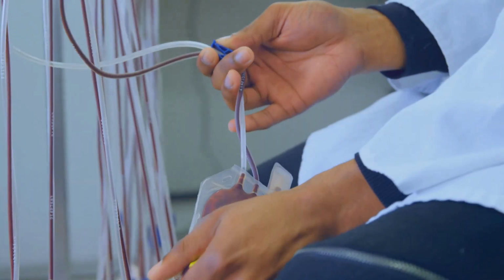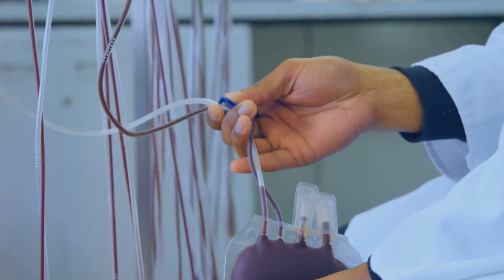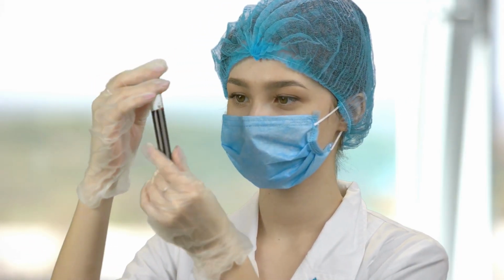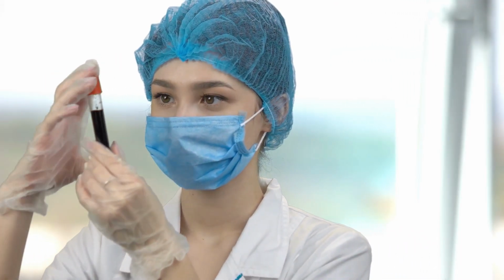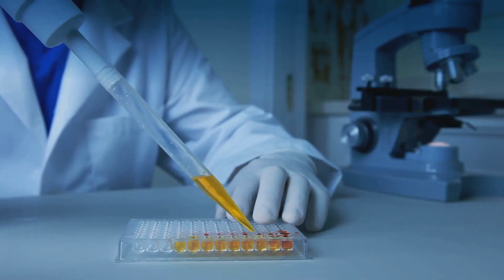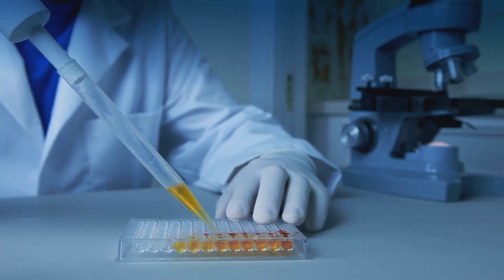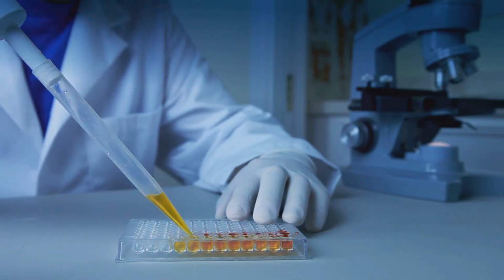The first step involves verifying the sample information meticulously. This includes checking the patient's identification details, ensuring that the sample matches the accompanying documentation. The type of sample received and the requested test must also be verified to ensure accuracy. Any discrepancies between the accompanying documentation and the received sample should be immediately investigated and documented to prevent any potential issues later on.